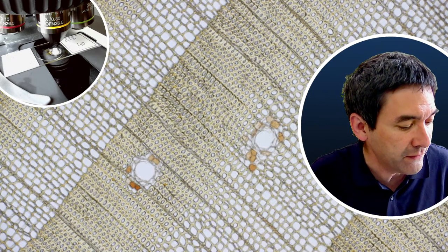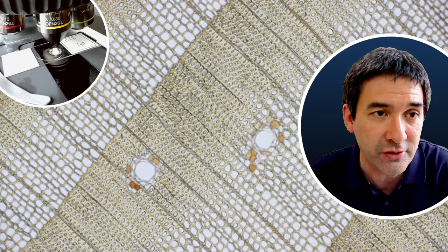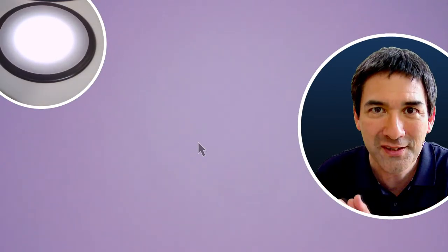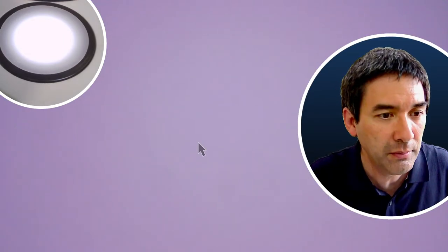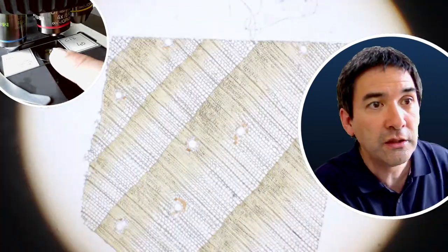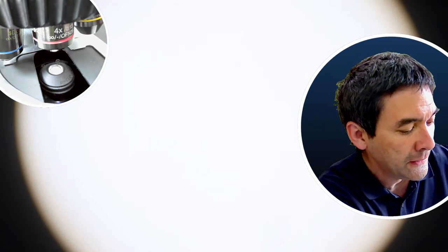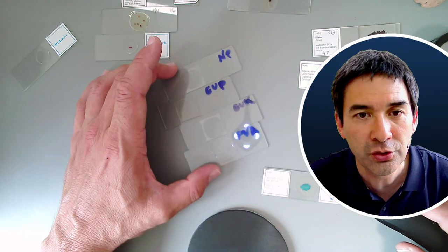What I would like to do now in the last few minutes — I promised some of you this earlier. What I've done today is use a stereo microscope for slides, kind of using it for the wrong purpose, to show that it still works quite well. It is also possible to put larger objects like small insects directly under here using the low-power magnification and shining a flashlight on top. But what I'd like to do now is change topics, because I've got over here some four slides of diatomaceous earth that I wanted to show you as well.